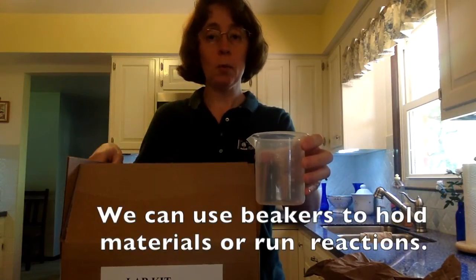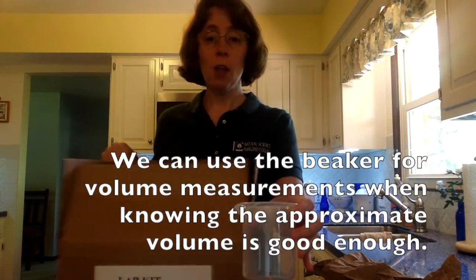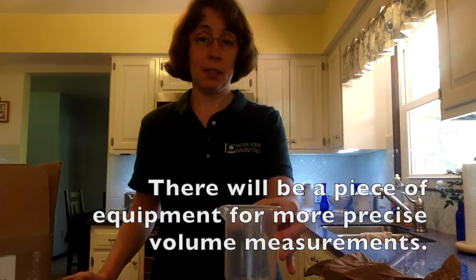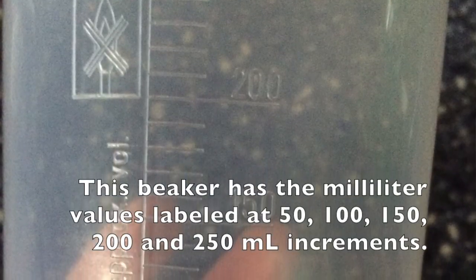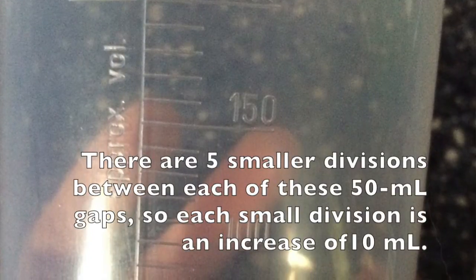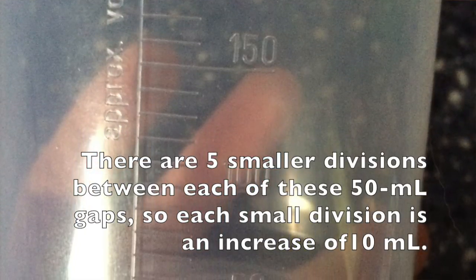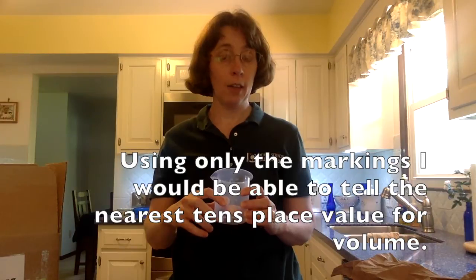We can use beakers to hold materials or run reactions. We can use the beaker for volume measurements when knowing the approximate volume is good enough. There will be a piece of equipment for more precise volume measurements. This beaker has the milliliter values labeled at 50, 100, 150, 200, and 250 milliliter increments. There are 5 smaller divisions between each of these 50 milliliter gaps, so each small division is an increase of 10 milliliters. Using only the markings, I would be able to tell the nearest tens place value for volume.